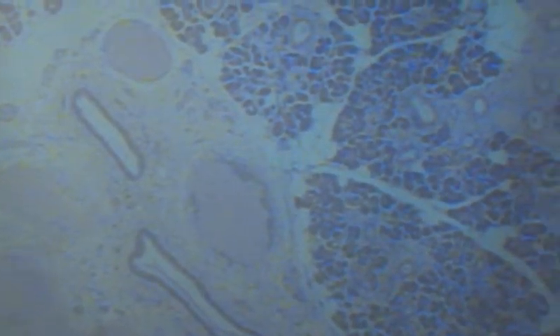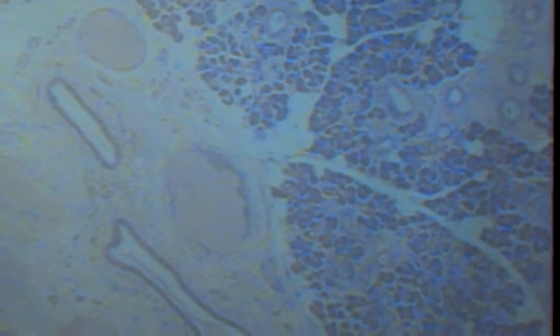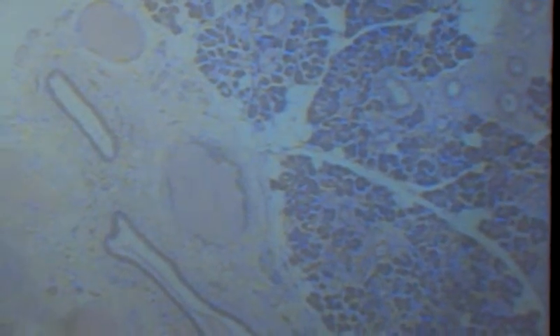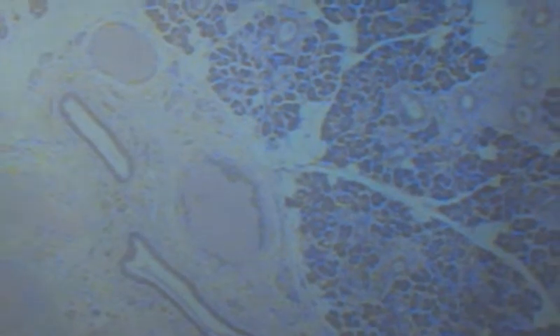The question that I always get is, I don't see any mucous cells. Can you help me find them? No. There aren't any there. There are no mucous cells in the parotid gland. So if you're not seeing them, guess what? Move to a different mount on that slide.